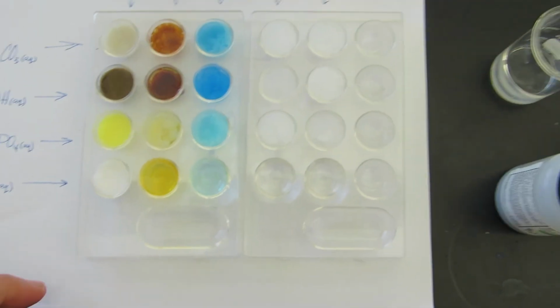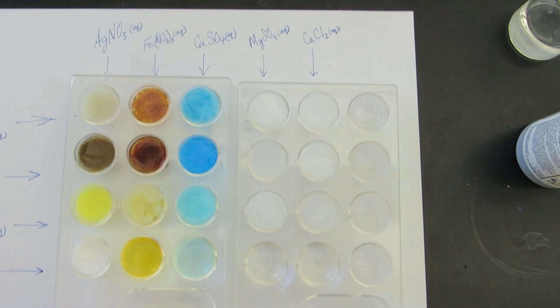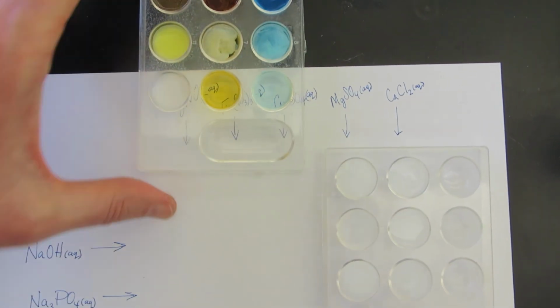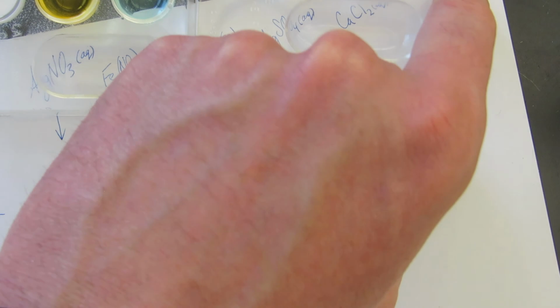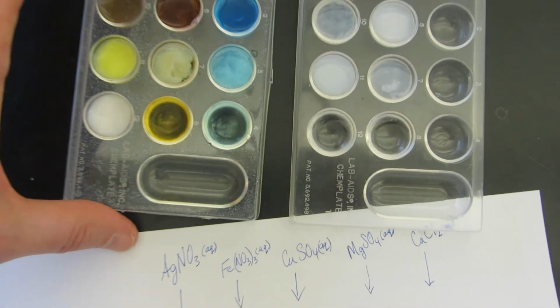So when you are looking at these in the lab, sometimes using the white paper is helpful. Sometimes looking with the black background is easier. Just kind of do it. Whatever works.